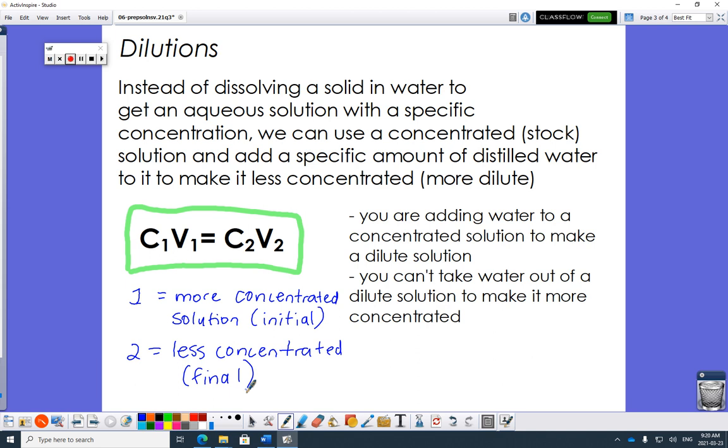Okay? We're going to use graduated cylinders today to make our solutions. You could even get more accurate apparatus called pipettes. We normally just use those little plastic ones that are about 1 milliliter, not very good, but you can get really graduated pipettes that have lots of calibrations to them. In biology, you might have even used micropipettes, which measure super tiny amounts, because obviously in bio we sometimes deal with micro amounts. But today we're just going to use a graduated cylinder.